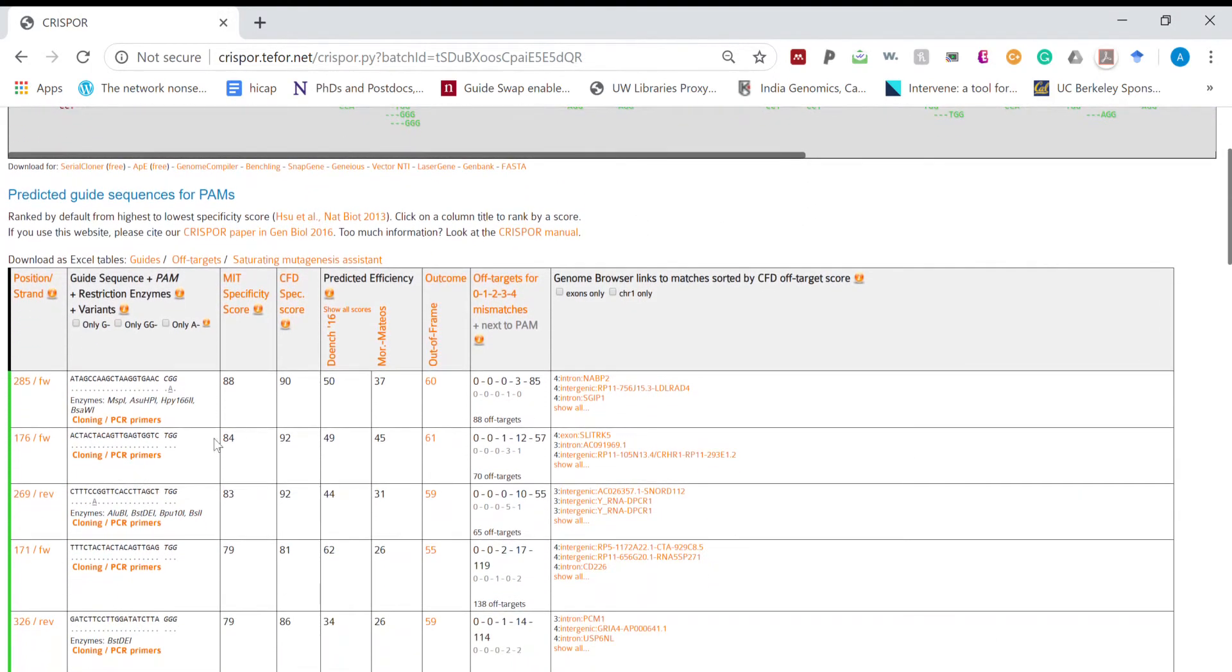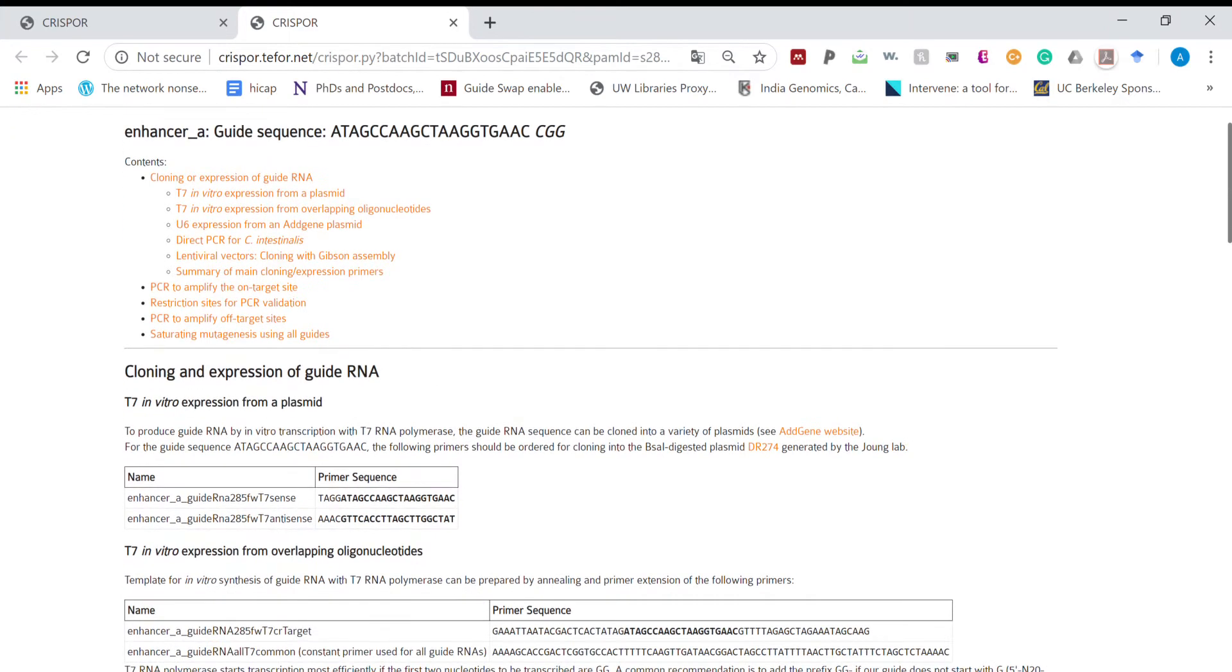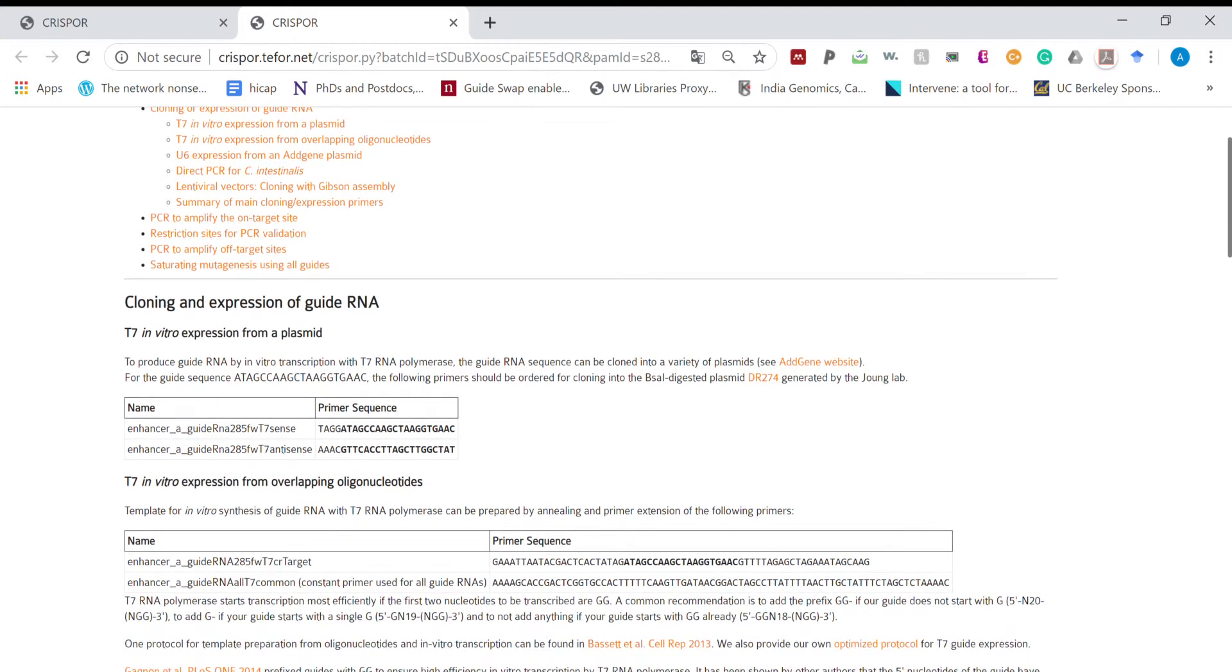We can also observe the cloning strategy we want to use. If we want to use RNP approach T7 cloning strategy, in this case we can order these two primers and using in vitro transcription we can make RNA for RNP approach.